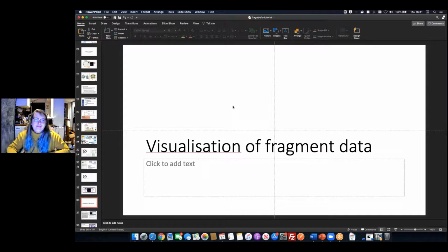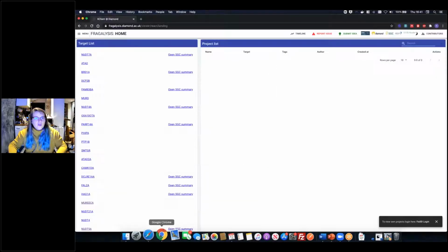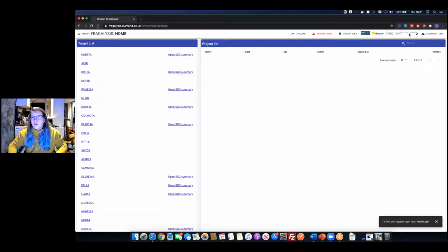Okay, I think that's all the questions for now. So let's head on. Okay, cool. So I'm going to jump on Fragalysis at this point because I think we're 40 minutes into a talk and I haven't even showed you the platform yet.